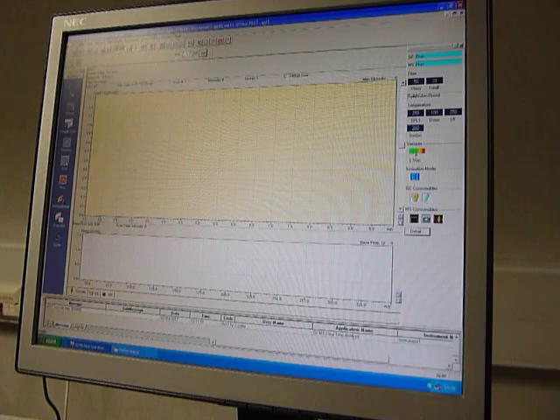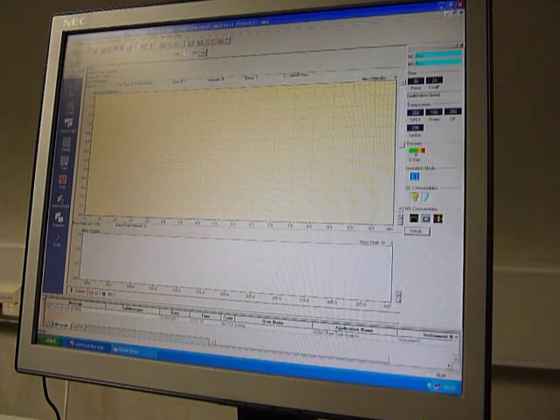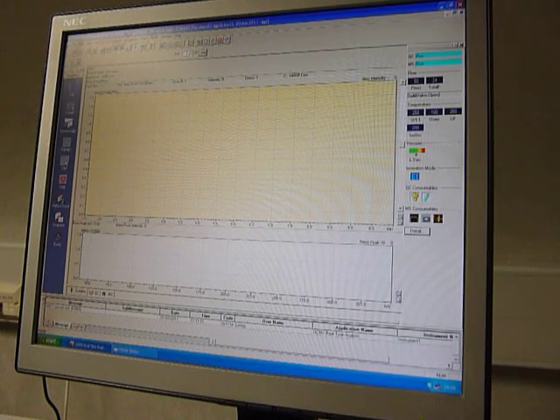The method is set up where the filament — it's an electron ionisation system — doesn't turn on until one and a half minutes. That's to allow the big solvent peak to go through without hitting a hot filament and shortening its lifetime. At 0.48 minutes now — at 1.5 minutes you'll see everything switch on. You can see it's now in the run because it's gone from green to blue, so everything's nicely visual and the software is easy to use.